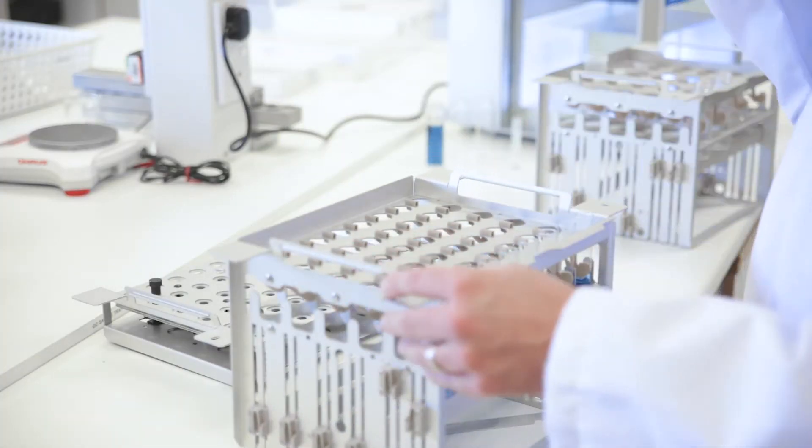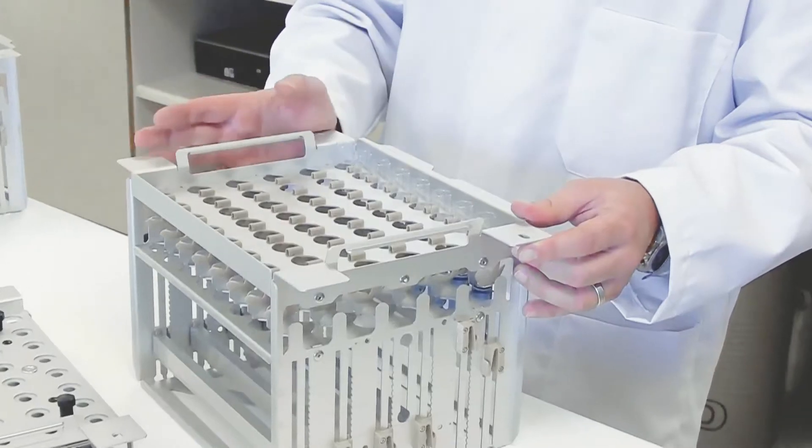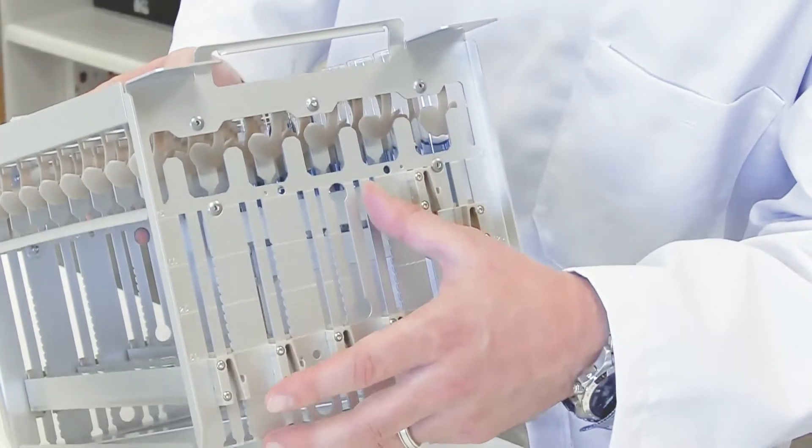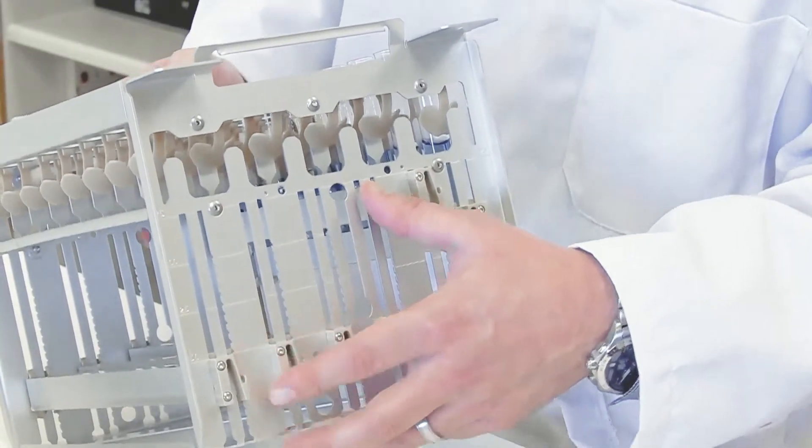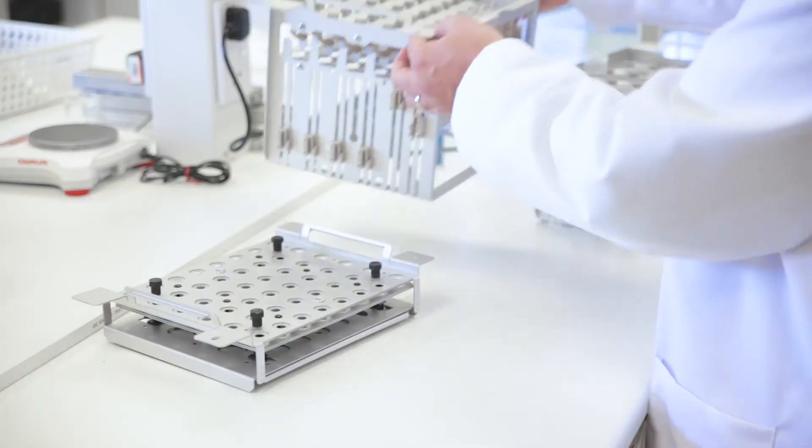We've got the 48 position rack here. This will take sample tubes from 10 to 20 millimeters outer diameter, from 75 millimeters in length up to 150 millimeters in length. There's a vast amount of flexibility in these racks.